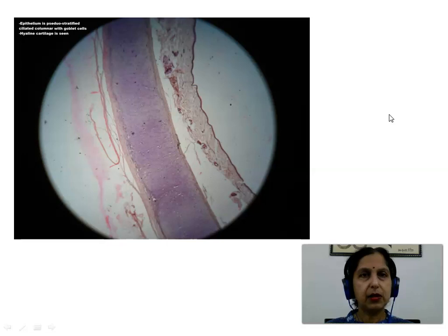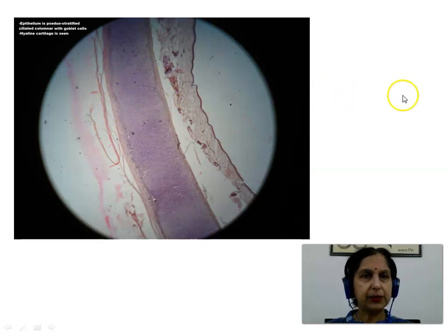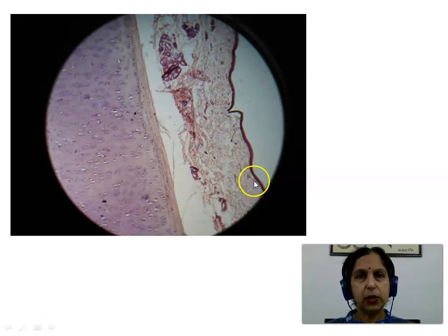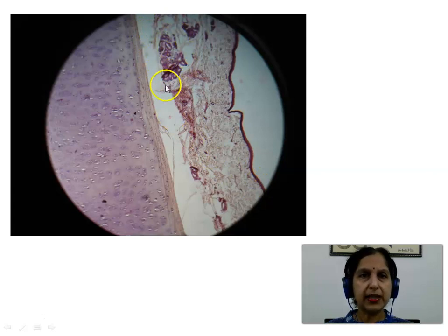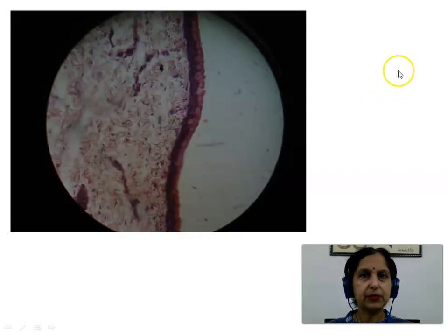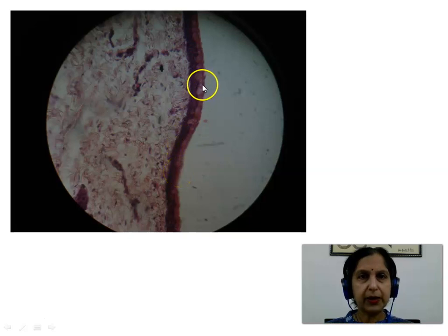Another view showing all four layers: mucosa, submucosa, cartilage layer, and the adventitia. A slightly magnified view shows the perichondrium with outer fibrous and inner cellular layers and the hyaline cartilage. A slightly magnified view of the lining epithelium shows pseudostratified ciliated columnar epithelium with goblet cells.